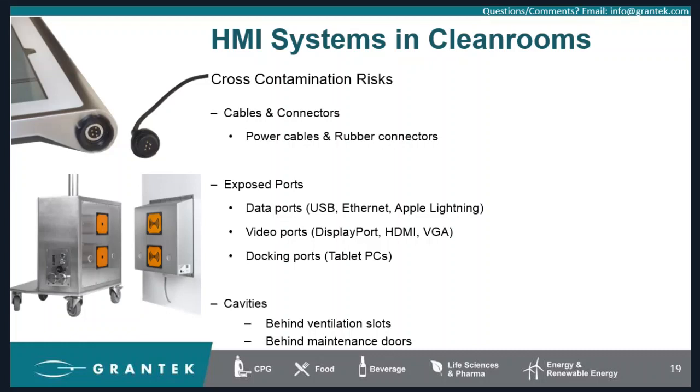Also, as I said before, exposed ports, any data ports, USB, Ethernet, Apple Lightning for people that like the iPad, video ports, display port, HDMI, VGA, they are a nightmare to clean properly, and you can't really spray them down with the cleaning agent because you might damage them that way. And then also the docking ports, what we talked about earlier, for your tablet PCs.